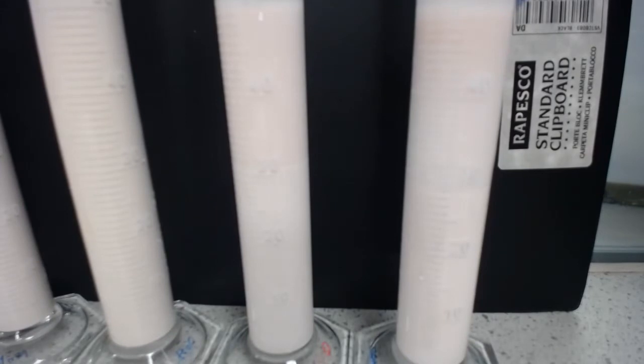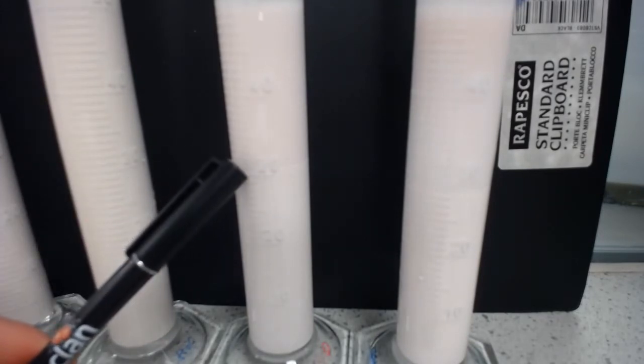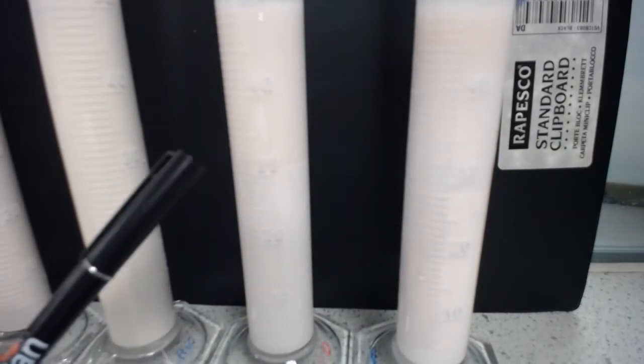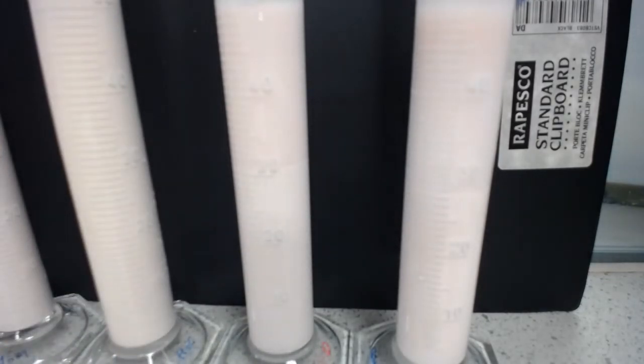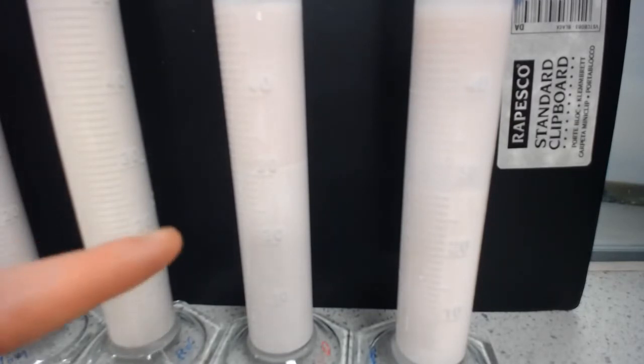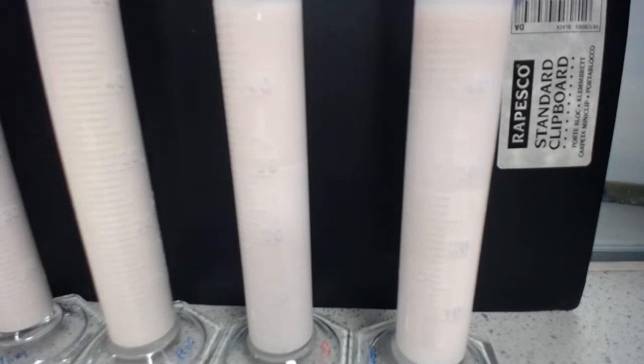And hopefully you can see that just above the 30 millilitre mark, and just below the 30 millilitre mark here, we've actually got splitting happening there. So for me, I would say that formulation D has got 31 millilitres, the volume of sediment, and formulation E has got, let's say, 28. And we would do the division 31 divided by 50 to work out the sedimentation ratio, and 28 divided by 50 to work out the sedimentation ratio.